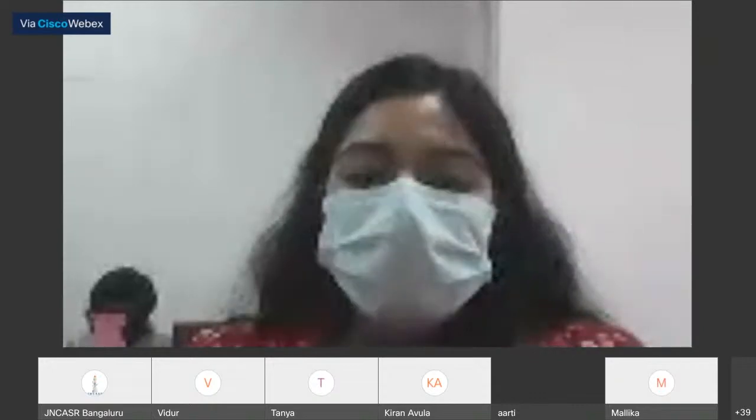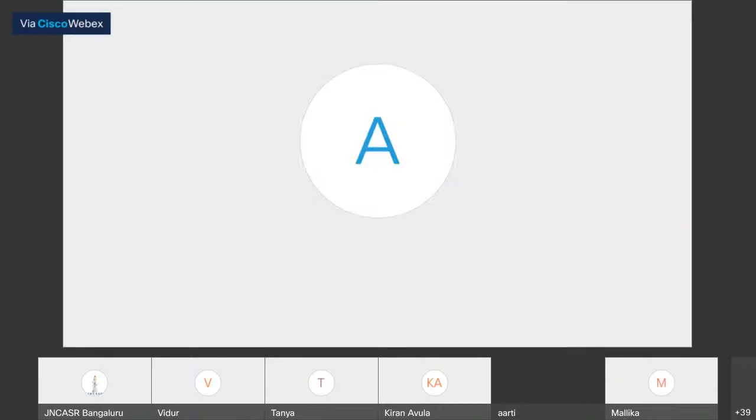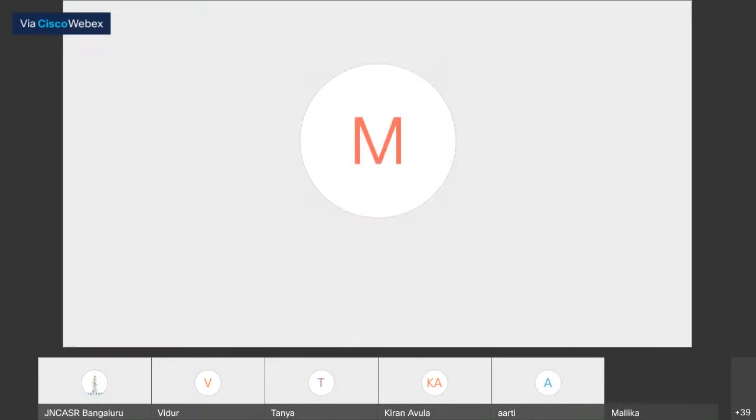Now Malika will be giving the instructions for this session. Over to you, Malika. Hi everyone. I hope all of the participants have downloaded the necessary files for this session and you have the Fiji app installed on your system. Because this is a practical session, for any doubts or questions you can ask then and there. You can either raise your hand, put your question in the chat, or unmute yourself and ask. All three ways you can ask. And yeah, over to you, Shravanti and Vidur.